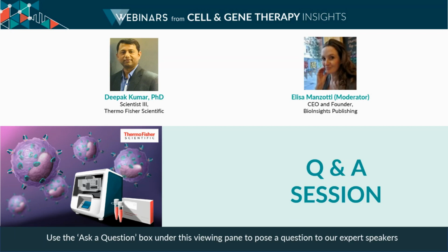Excellent. And another question in from the audience. How did you detect the CAR expression in NK cells by flow cytometry? So in that workflow, you can see here, we have the tag, it's called the V5 tag. Once we incorporate it, over time we just do flow cytometry to measure the percentage of CAR NK by using the V5 antibody. This way, we measure how much CAR NK is there.